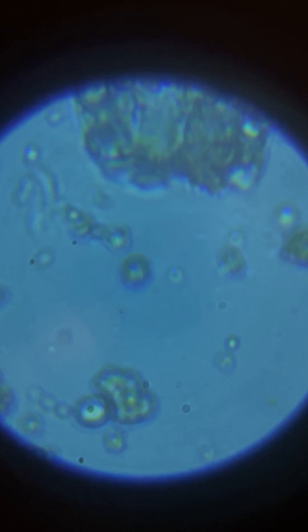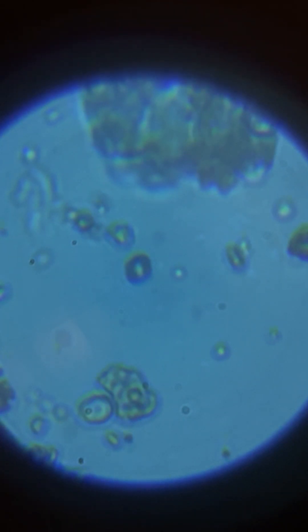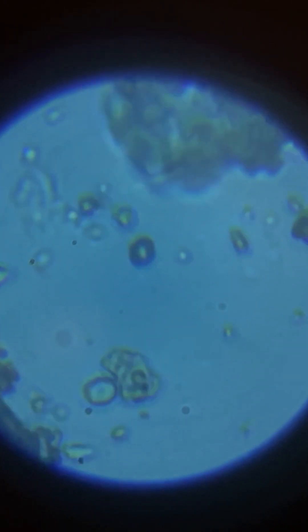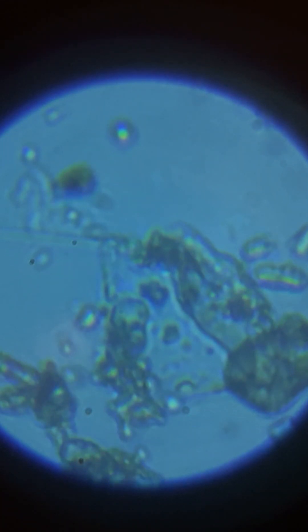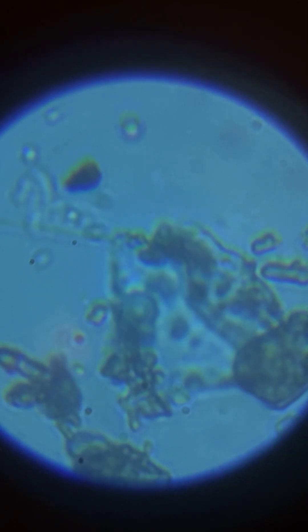Hello! Little focus for us. Look at them. That was in my vacuum cleaner and that is on my counter now — all that dirt is on my counter. Alright, we're going to find a different spot. Let's go find another area where these kids live. I'm done seeing these in the little neighborhood. Got a little big boy in there — you see him?